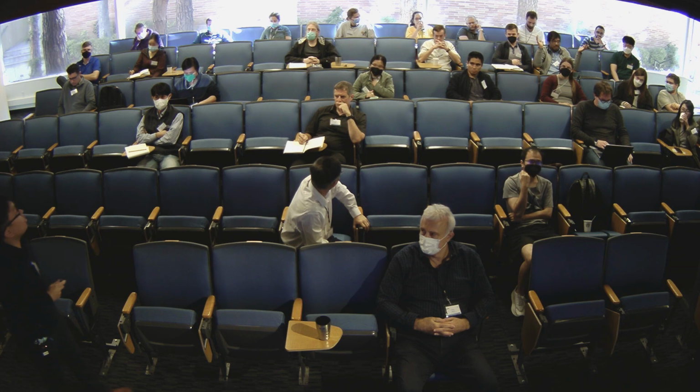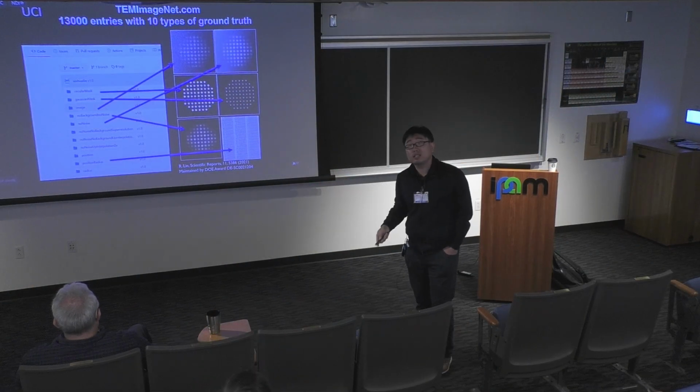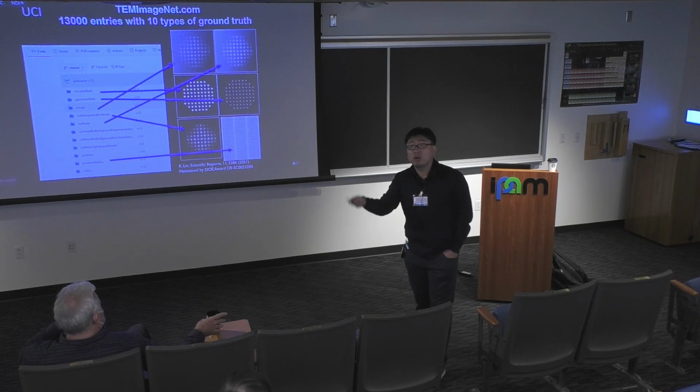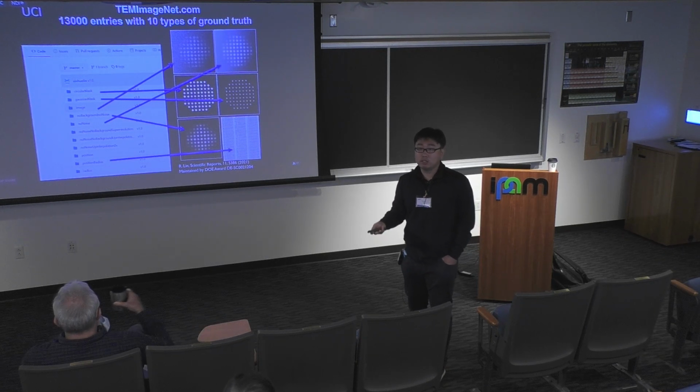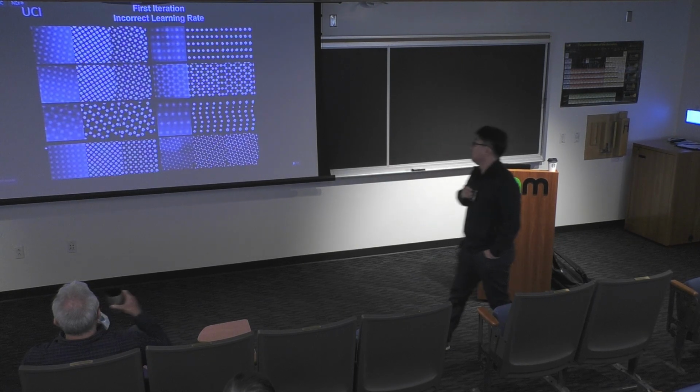Well, you need to blur it with a reasonable point spread function. That's basically one part of the forward model. The other part of the forward model is getting the correct noise, right? So that's all it needs.